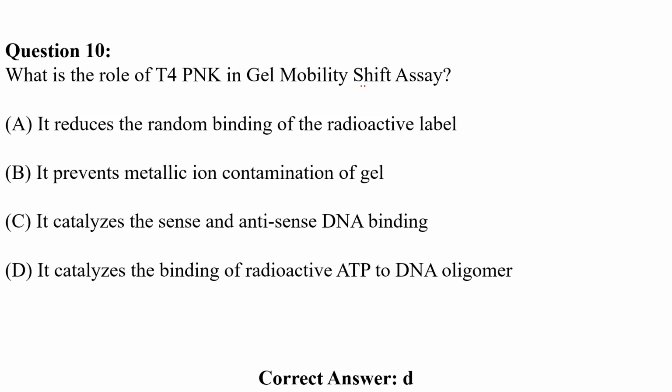For gel mobility shift assay, we have to first label the DNA molecule or the oligonucleotide that we have. So let's say we have a DNA molecule. First we'll have to label it so that we can visualize it through autoradiography, as I explained previously. Then what do we do in gel mobility shift assay? We basically study the DNA protein interaction.